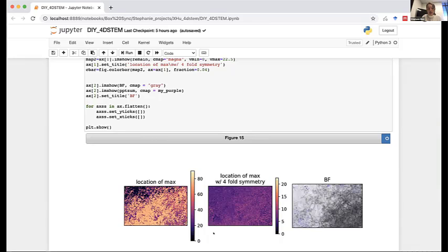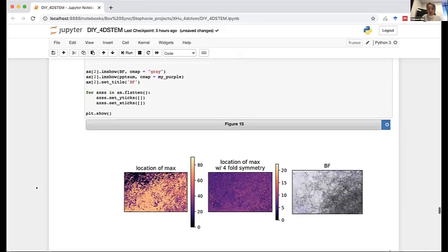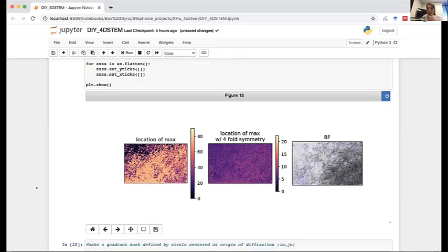So what we could do with this analysis, if we were to go further and not something for today, is once you start to understand rotation for a sample with a known lattice parameter, you could start to quantitatively assess stress and strain within your system. So this would be a very different technique, but something you built yourself to try and get at some of the information from the cool tools that we saw before that Digital Micrograph has for analyzing strain.